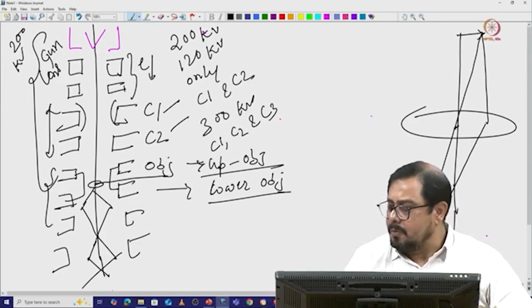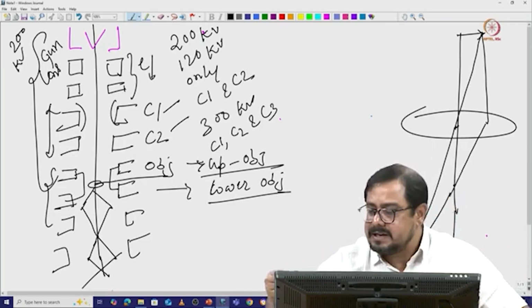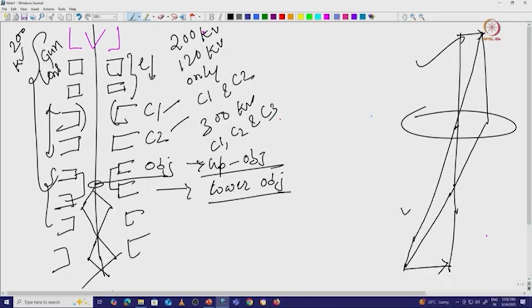So the electron microscope is also going to work in the same way, and that is the reason we initially discussed how this optical lens system, or glass lens system, works. If this is my object, this is my image. You can see that the image is inverted in this particular direction. The rays will come and merge here and give us an image. So it is always an inverted image, and it will be bigger in size.